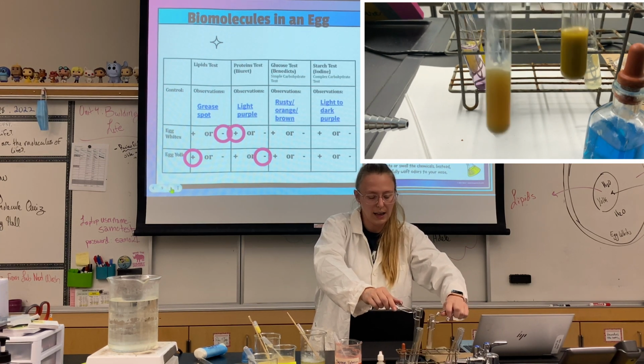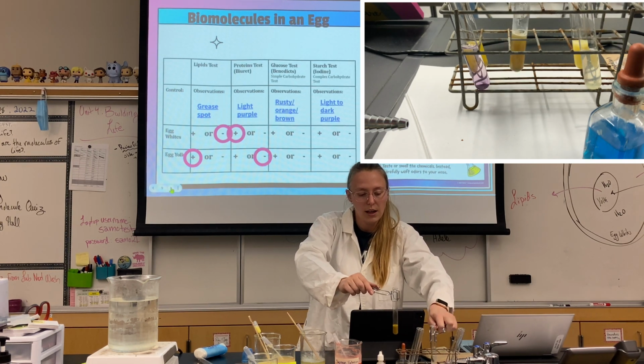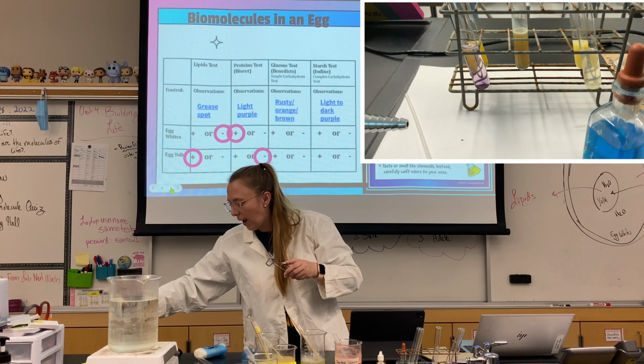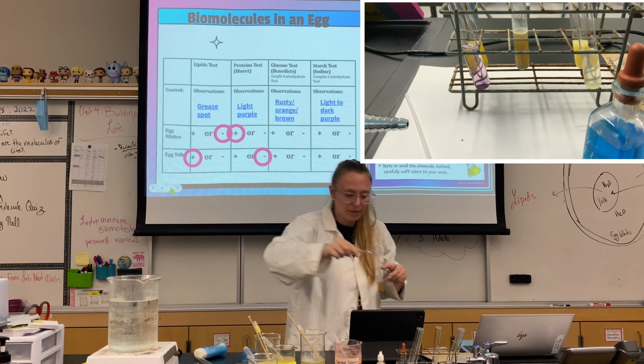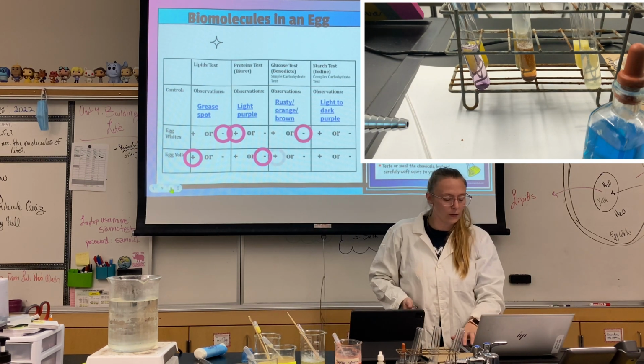This was our egg yolk. That means our egg yolk is positive for glucose. And if we look at our egg whites, again, they are negative.